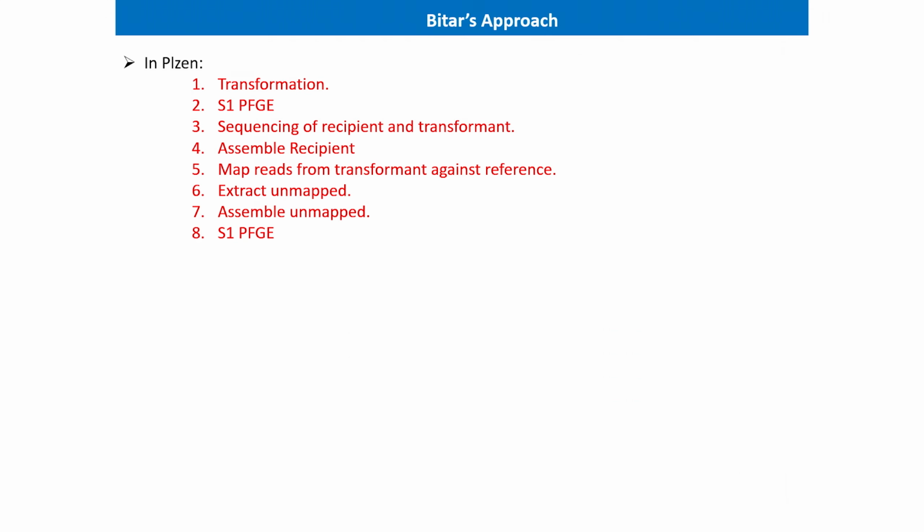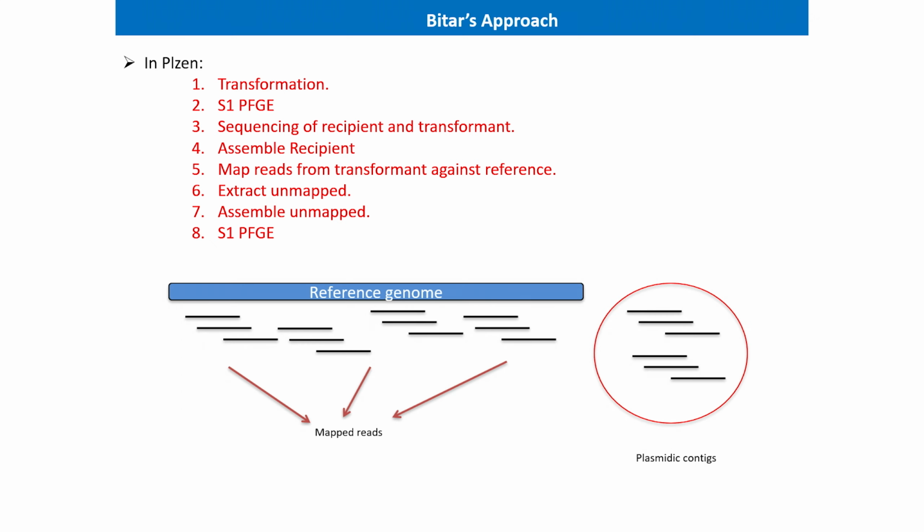So what I used to do is what we call transformation. So I extract the plasmid of interest that has the antibiotic-resistant gene that I'm interested in. And then I will do transformation and insert it in a recipient cell. Normally, it's in a TOP10 Escherichia coli. These recipient cells are a kit that you can buy from different vendors, and the genome is closed and completed.